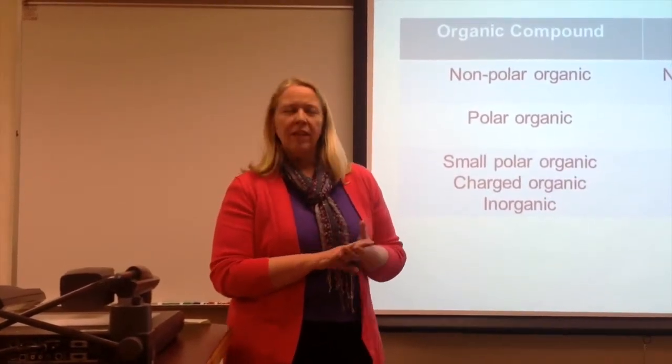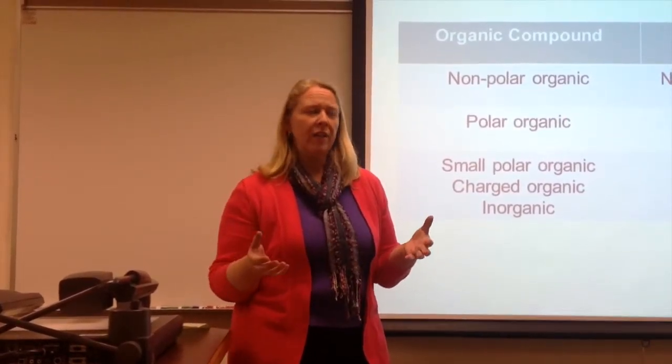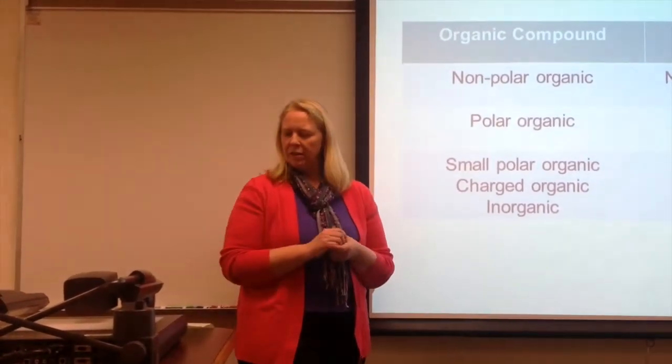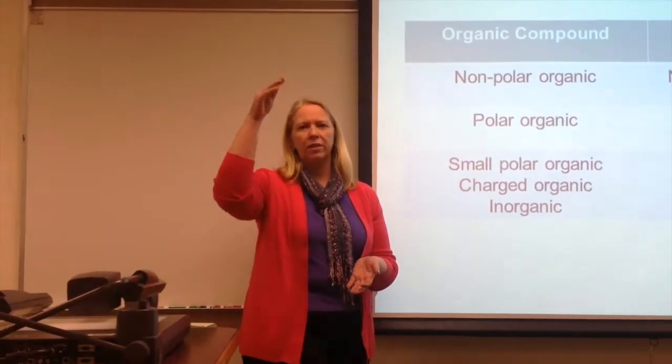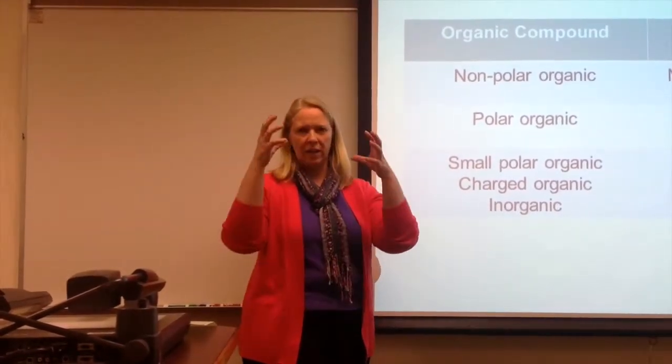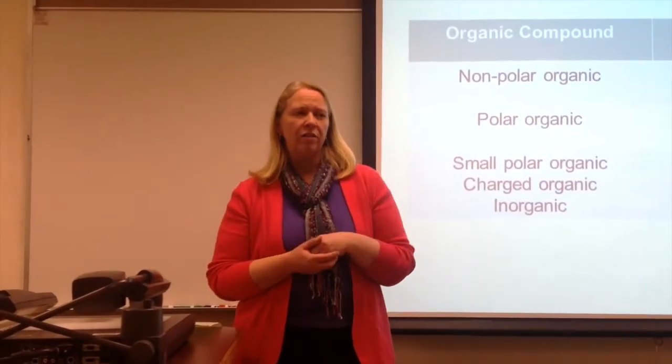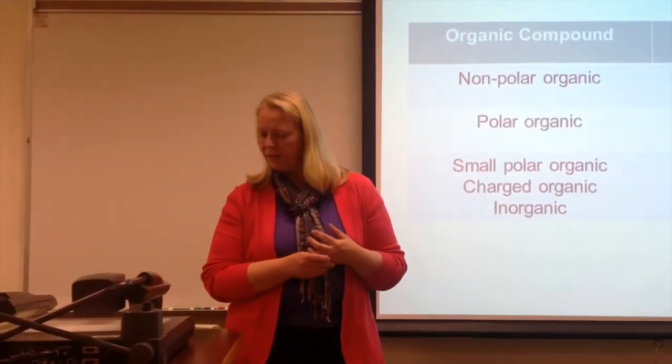And then later in the quarter, we're going to do column chromatography, where you have basically a solid material in a column, and you load your mixture of compounds on top and then use the solubility in the solvent and the interaction with that solid phase to separate your compounds.